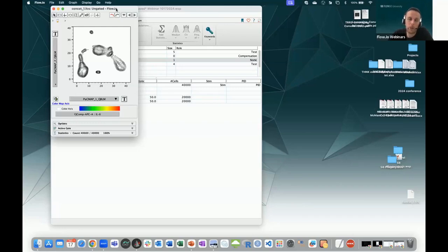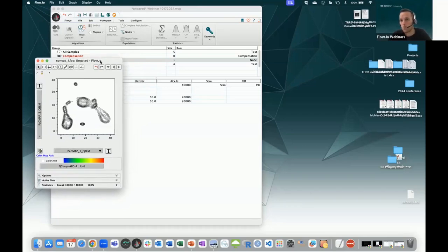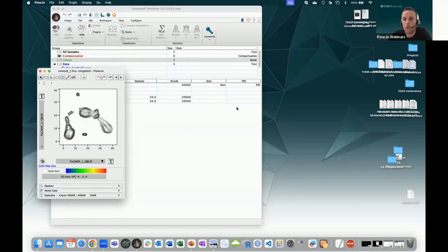What I recommend is the more RAM, usually the better. I have 16 GB of RAM on my Mac and an i9 processor. This computer is 3 years old, so it's not the best computer on the market currently. As long as you have 4 times the amount of RAM on your computer as the quantity of data that you put in FlowJo, you should have plenty. Okay?